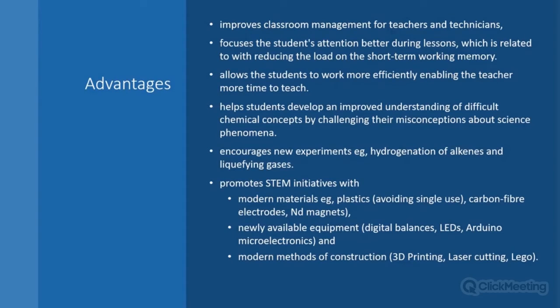Thank you very much. Right, thank you, Bob. I use the electrolysis setup as well. I've done it in online lessons, live and recorded, with my classes, and it's a great way of showing electrolysis, and it generates low amounts of chlorine and toxic gases as well. So it's a nice, easy thing to do as well.